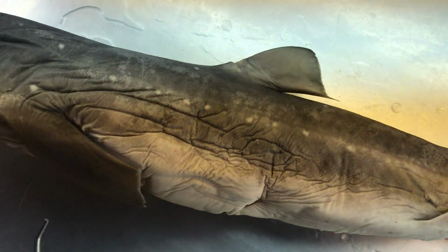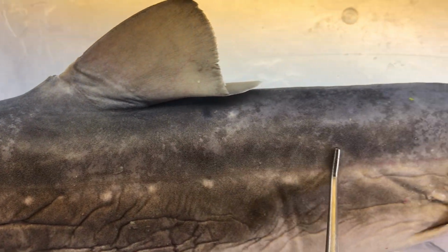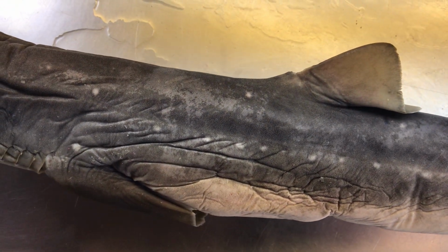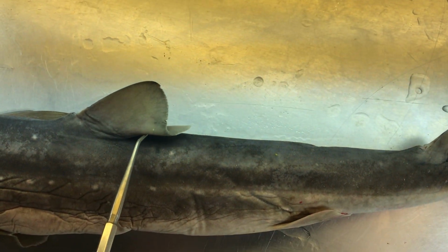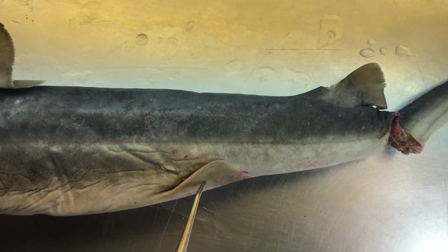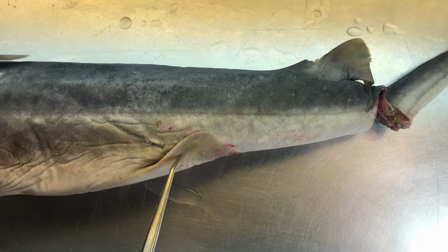Okay, for the trunk, now all the sharks have one type of scale. Those are placoid scales. We find placoid scales only on sharks and other cartilaginous fishes. In terms of fins, we have a dorsal anterior fin. We have a dorsal posterior fin. We have paired pectoral fins. These are the ventral anterior ones. We have a pair of pelvic fins. These are paired ventral posterior ones.